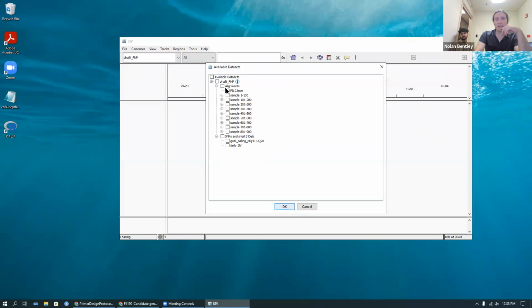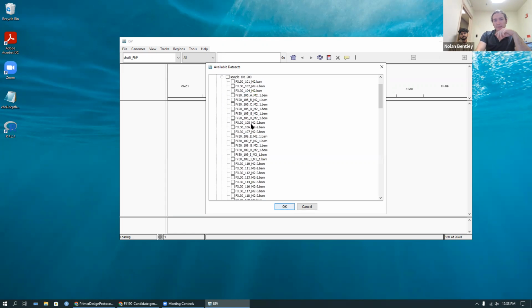I'm going to visualize the original lines. This is the mother of all of these. It's mostly inbred, so it represents them very well since there isn't much segregation going on since it's so inbred. And then I'm going to visualize a single sample. This idea of visualizing two at the same time is important because there is some weird mapping that just happens. So here I'm visualizing this mutant alongside the original genotype, so that offers a little bit of a control.